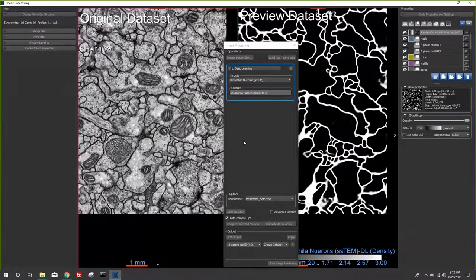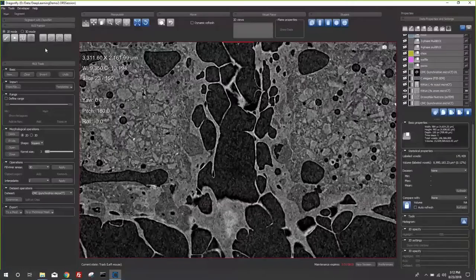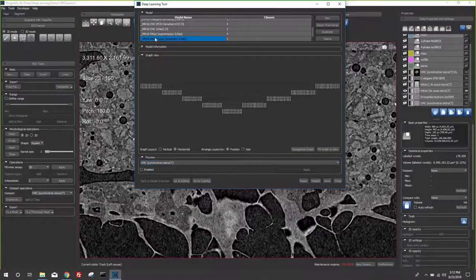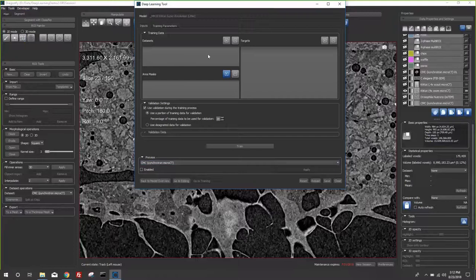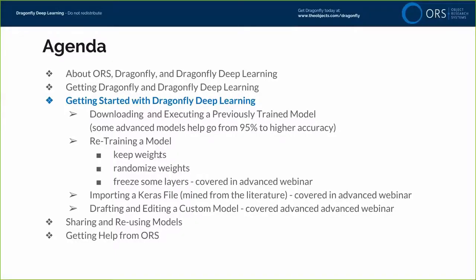You can download a model from the Infinite Toolbox and retrain it. You can also reset the model: in the Deep Learning Trainer on the Training page, clicking Reset will obliterate all the weights of the model. The model topology — the network layers and types — still exists, but all coefficients are erased. So you can either keep the existing weights or randomize them completely before retraining.